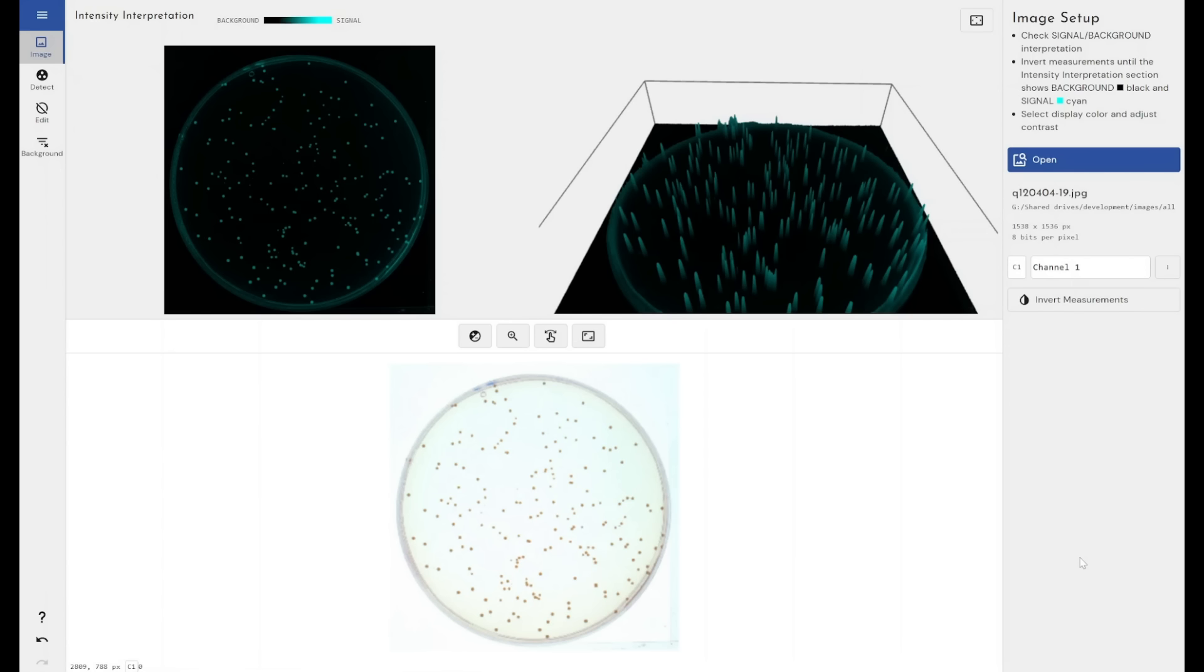Our software is open to all image types that you can bring in and automatically count colonies, detect colonies and take measurements. It's a much cheaper option to give you a lot of the benefit that those systems offer.